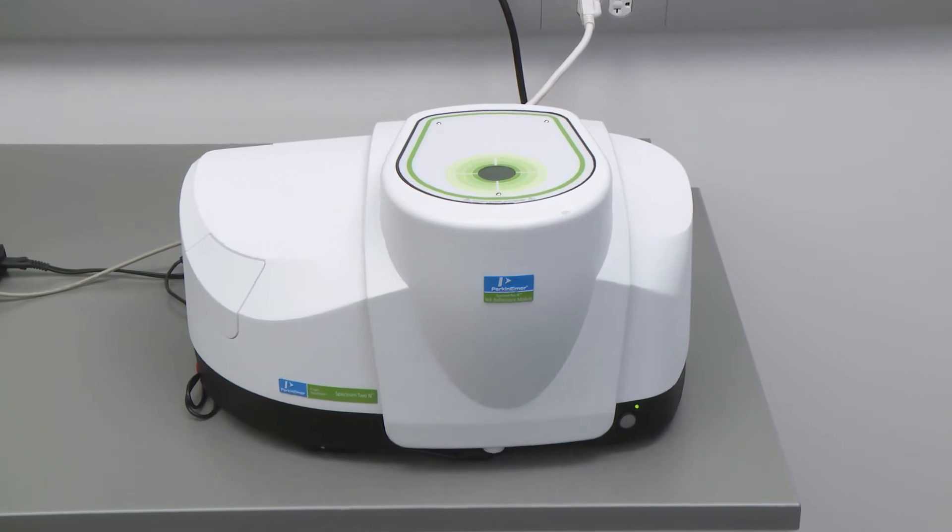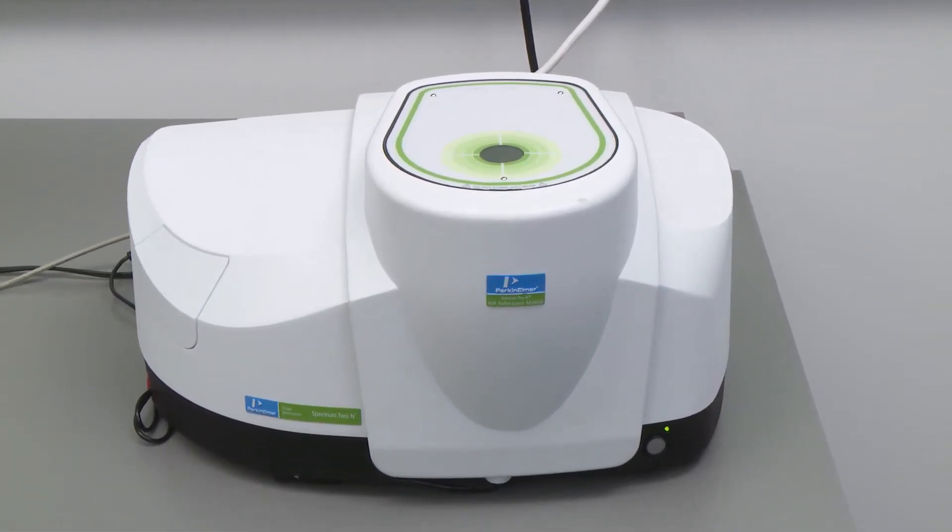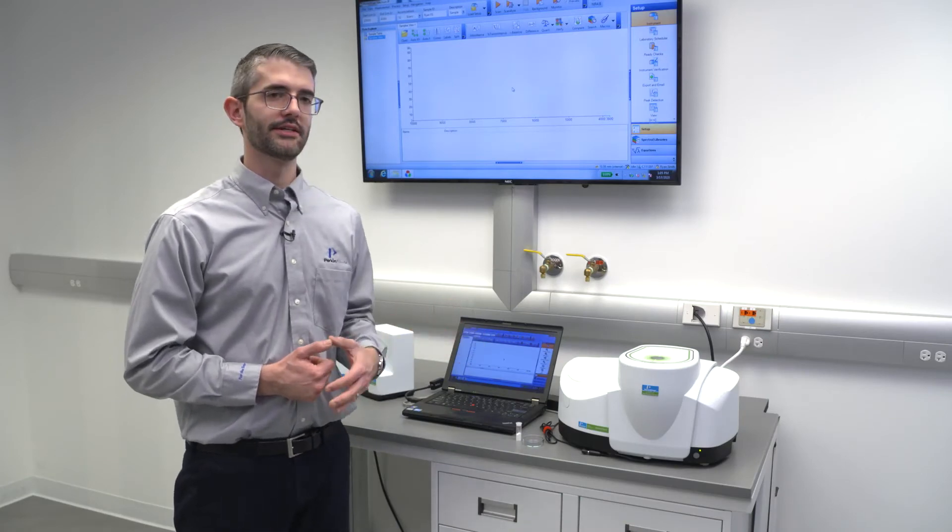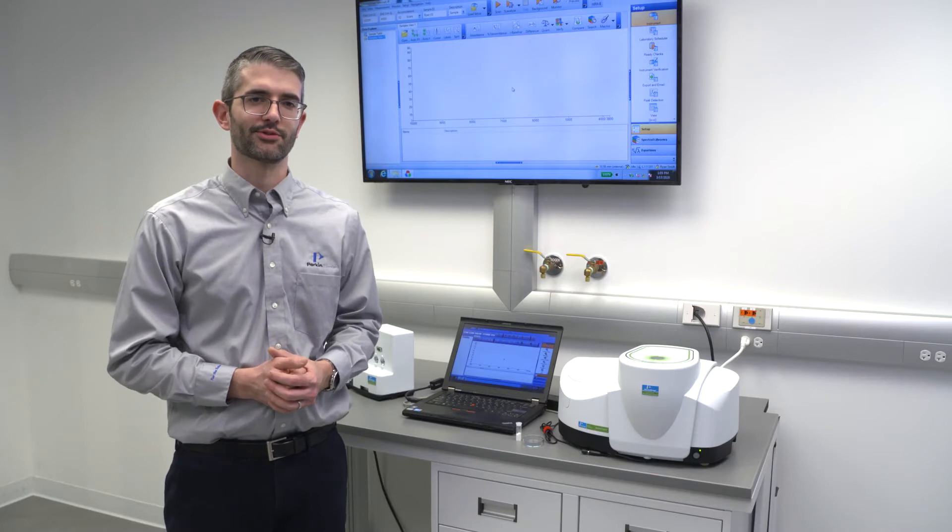This instrument is a combination of technologies that Perkin Elmer has developed over the years, wrapped up in a relatively small footprint package. This instrument is a dedicated single range instrument, meaning it performs measurements in the near-infrared spectral range.